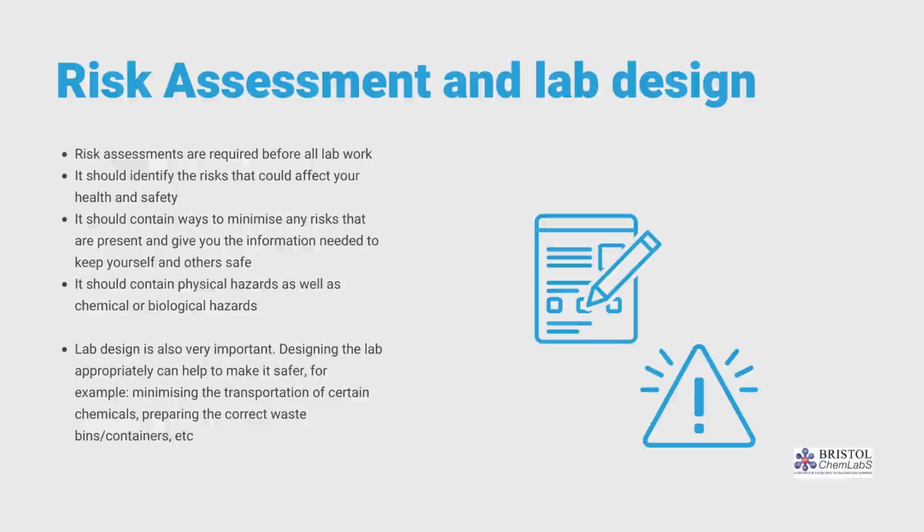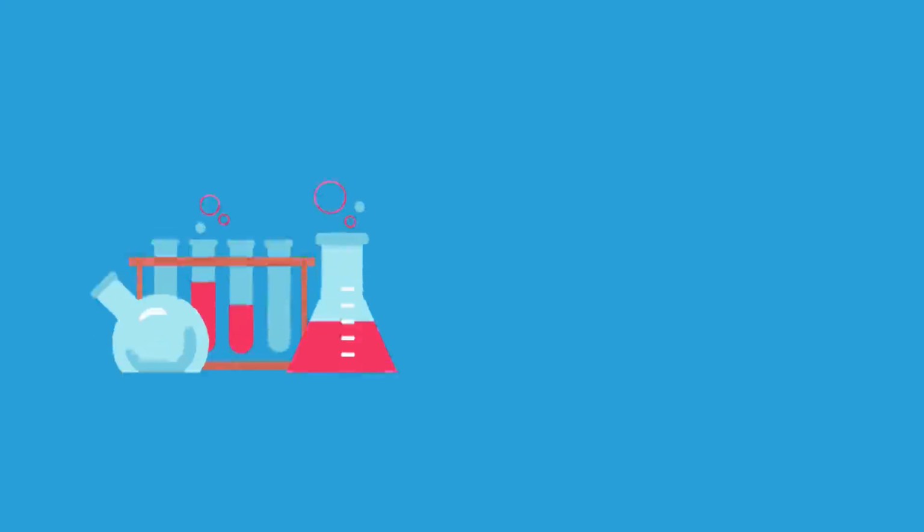Lab design is also very important. Designing the lab appropriately can help to make it safer. For example, minimizing the transportation of certain chemicals or preparing the correct waste bins for the lab.